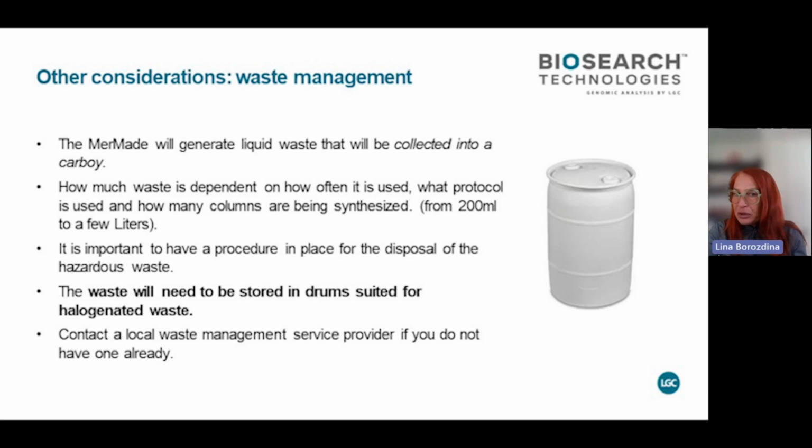So waste management. You want to make sure that you have set up your waste management for hazmat with a company like Safe Harbors, for example. They do come and take your hazardous waste, they take it away and they burn it.